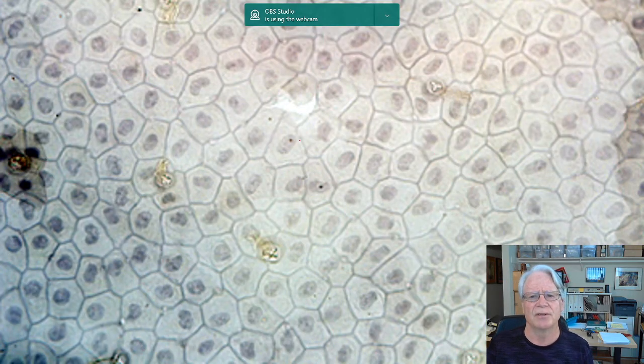Okay, another example. I'm showing you multiple slides. Why am I showing you multiple slides? Because when you are taking the test, you're going to see this tissue in multiple different ways. And so what I'm hoping you get from this is a search image and the ability to understand the basic structure.